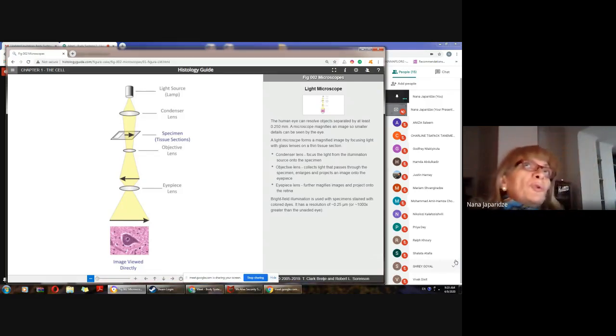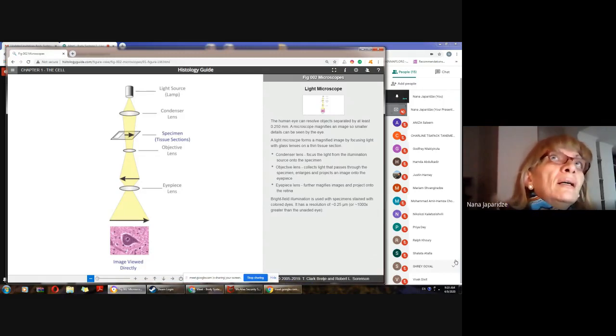When we put, for example, this tissue sample in toluene, this is another type of fluid which is able to remove the ethanol used during the dehydration from the tissue sample. After the clearance, we can put this tissue sample into a melted artificial substance which is used for embedding.